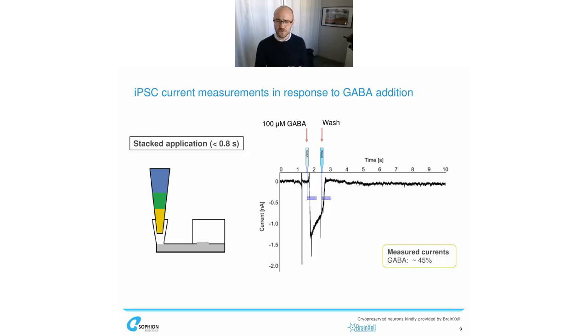In the next step, we also wanted to see whether these cells express any ligand-gated channel, and in particular, we used GABA to evoke a current. Since some of the ligand-gated ion channels desensitize quite rapidly, and in a drug development approach you might want to do consecutive stimulations, you want to assure that once you applied your agonist, you can completely wash it out and then apply it a second time, a third time, potentially including a compound to test for an effect. But to do that successfully, it's important to keep the ligand exposure time to a short time interval.